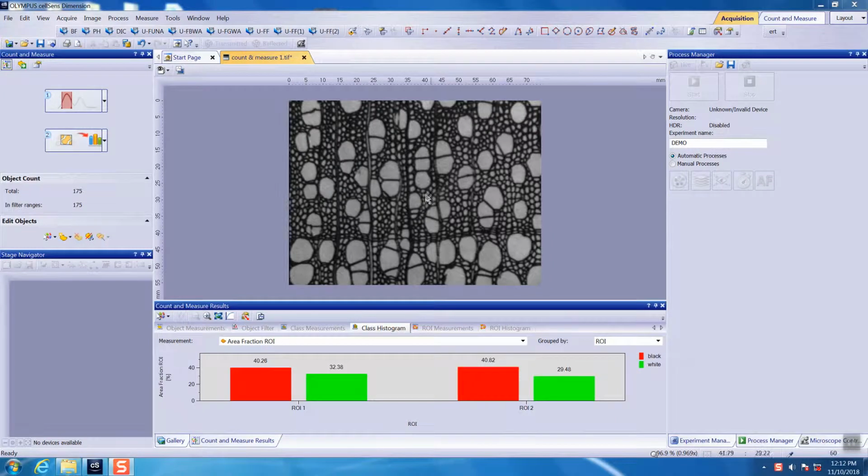In content measure, quite often you have to define a ROI, region of interest, for the measurement. There's multiple ways to do it. You can just draw a new one, for example, rectangle one. I already did two, so this is going to be number 3.